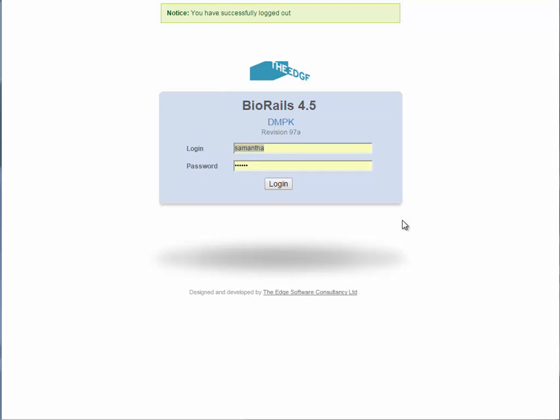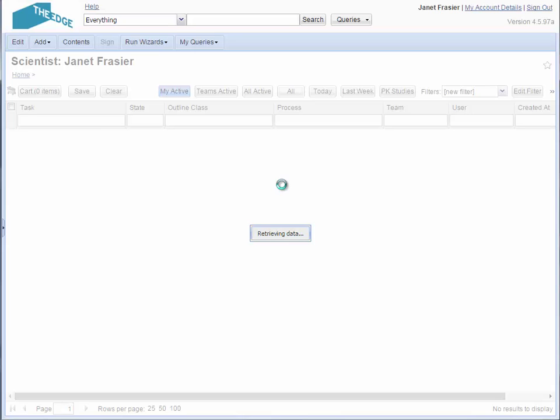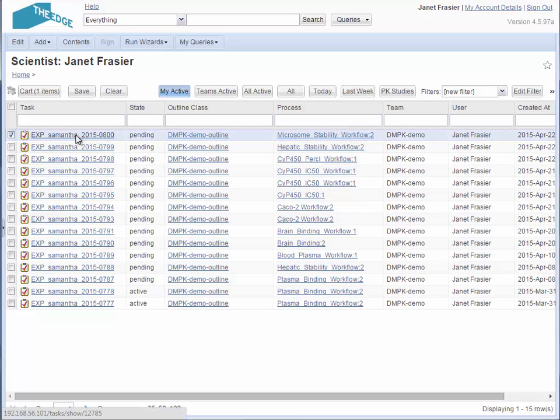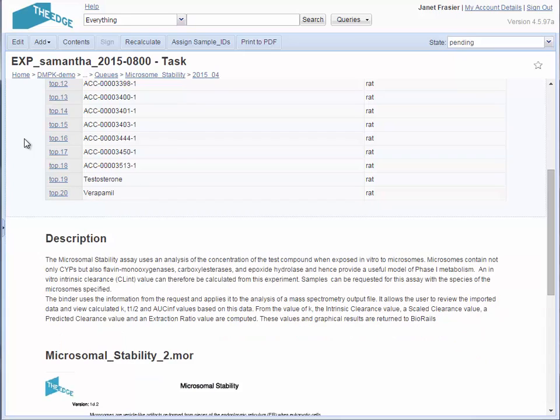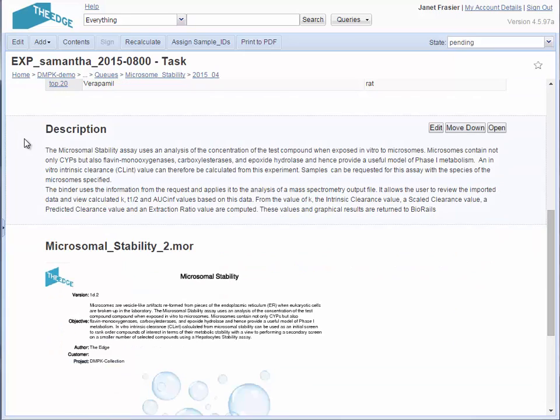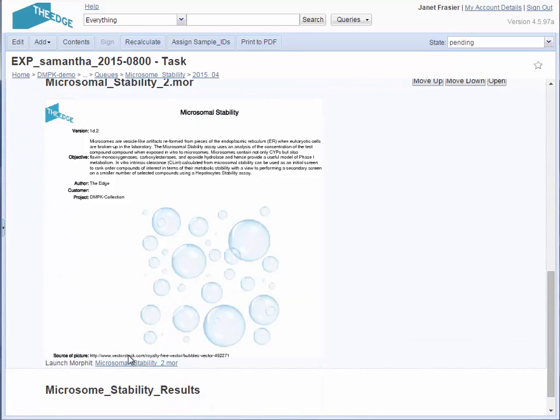I can now log out as Samantha Carter and log in as Janet Frazier. Janet's dashboard shows all the tasks that need to be carried out. The task sheet shows all of the details that are required and the analysis binder in Morfit can be launched directly from the webpage.